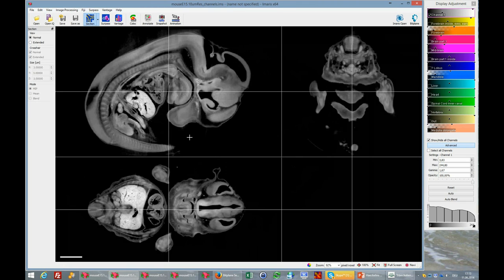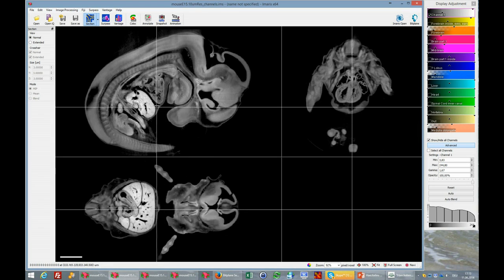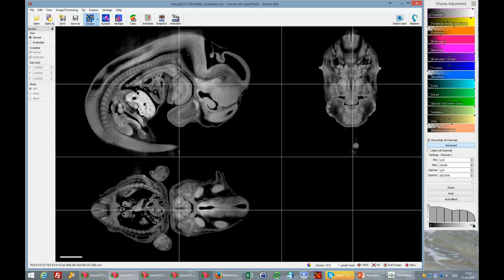Probably most of you know these kind of visualizations. So we have here the original cuttings, the layers, and then you can move up and down through the layers with this horizontal line. You see that this updates here the X Z view. So this is the X Z view, this is the X Y view, and this is the Y Z view. So you can travel through this and have a first inspection of the data set.